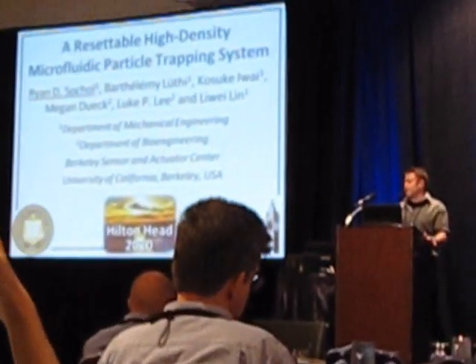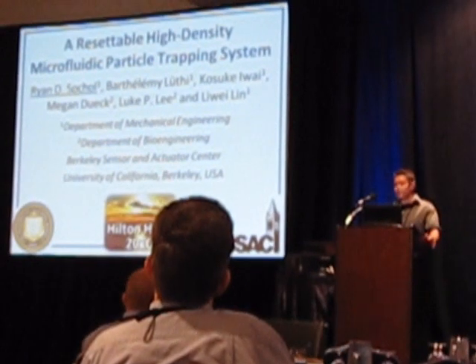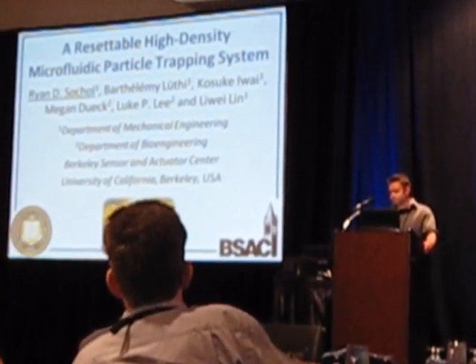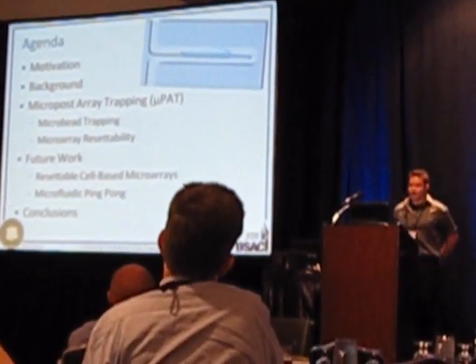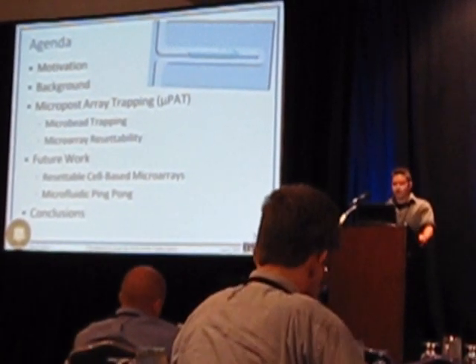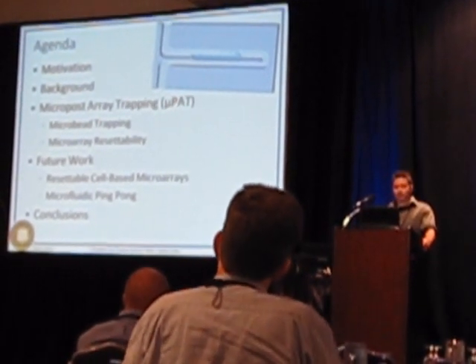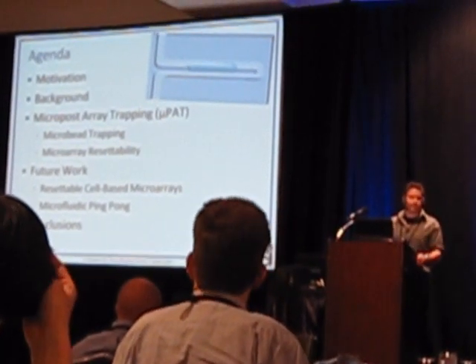And so today, I'm going to be discussing a simple technique that we use to trap and release microbeads from a dynamic microarray. I'm going to be first discussing why we want to be able to trap and release microbeads in an array. Then, I'm going to be discussing our technique to do so. And lastly, I'm going to be discussing some future directions for this project.